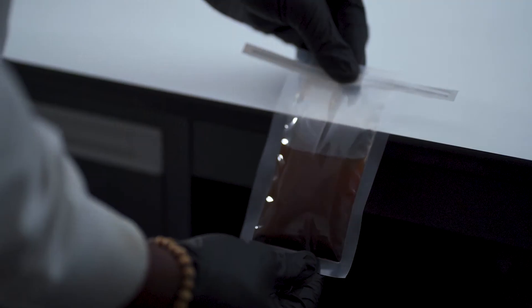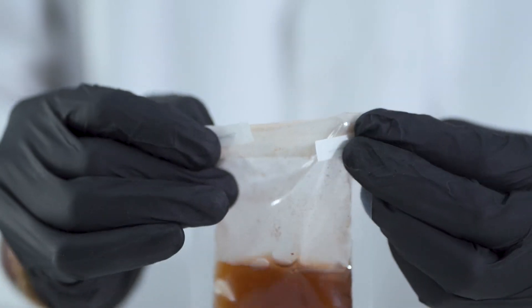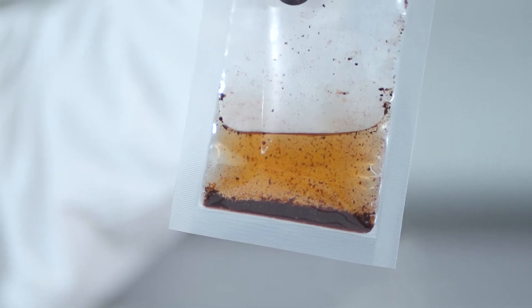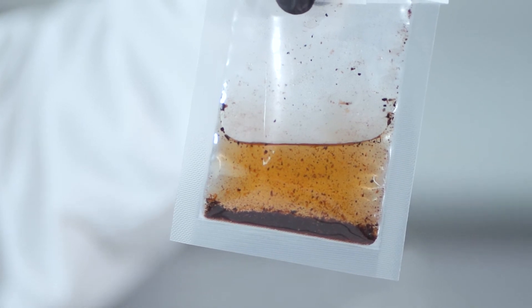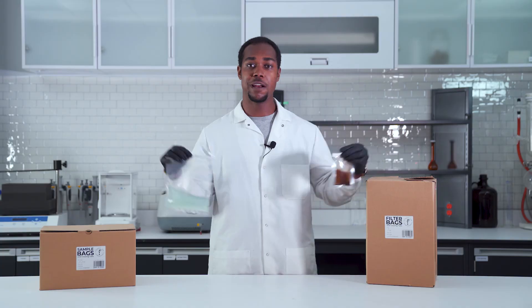Just like the sampling bag, you take the air out and then you secure the bag. As you can see, the large particulates are separated from the dirty sample. Here we have it guys, your two sampling bags — secure, tight, and ready for transport.